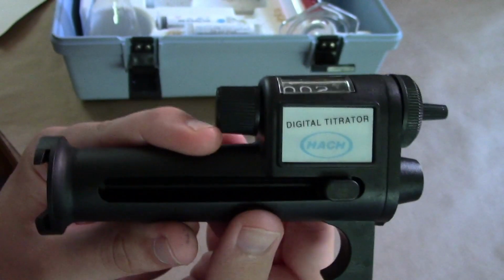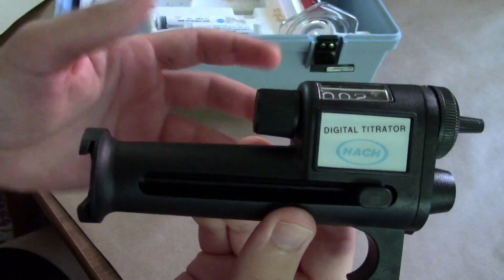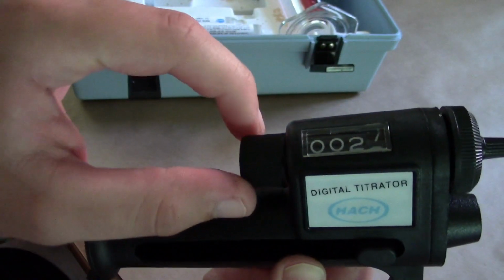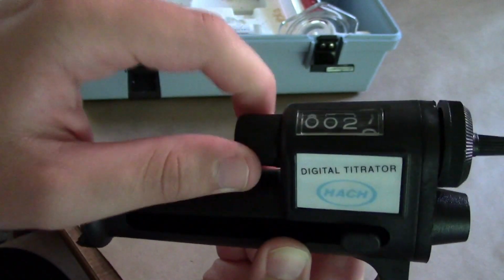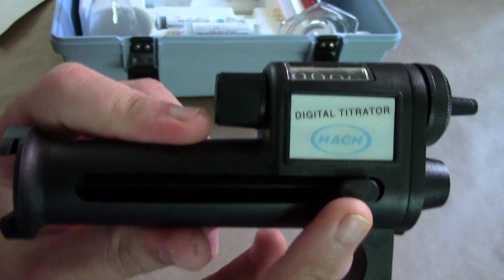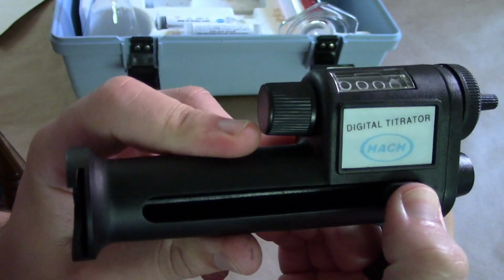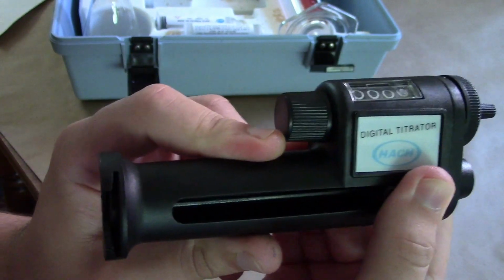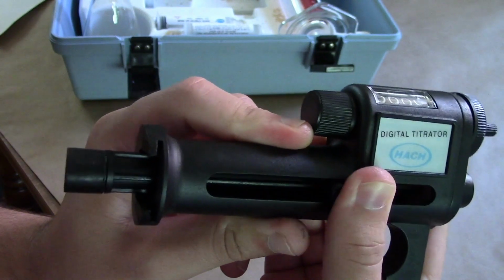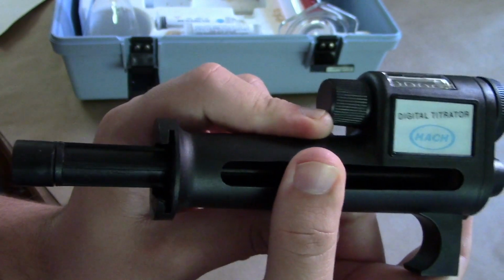Let's take a quick look at our digital titrator. There are 3 main parts to the titrator. We have this little knob right here, the purpose of which is to zero the counter, like so. This is the plunger, which, as you can see, if you press this and hold it in and then drag this forward, it releases the plunger, which is going to help us to dispense the acid.